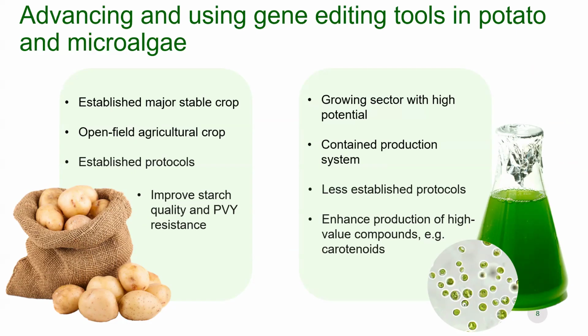Also for chlorella, one of the microalgae that we wanted to use in GeneBEcon, there are not so many established protocols, even none for some species. So there we had to start from scratch to develop the protocols ourselves. And we wanted to have protocols for gene editing to enhance the production of high value compounds, for instance, the carotenoids.